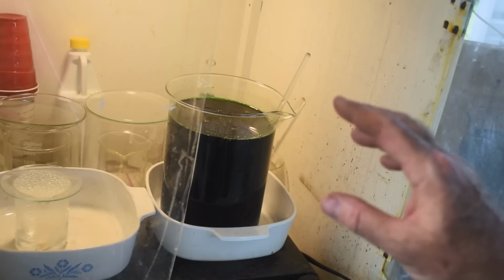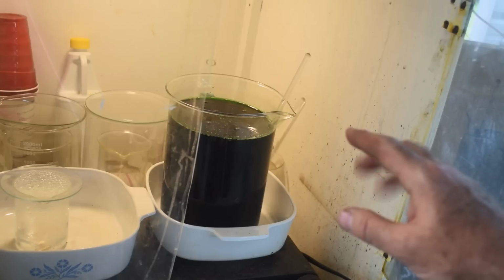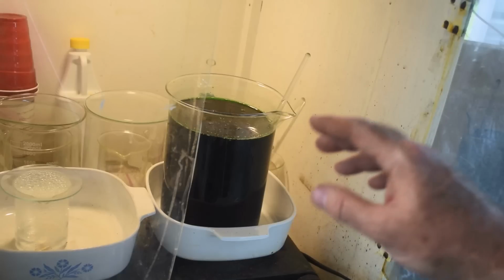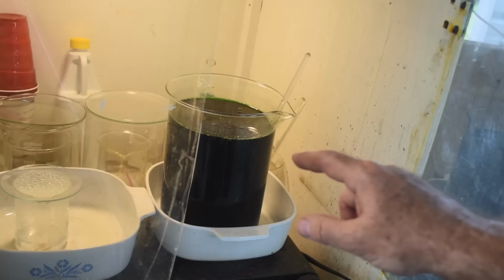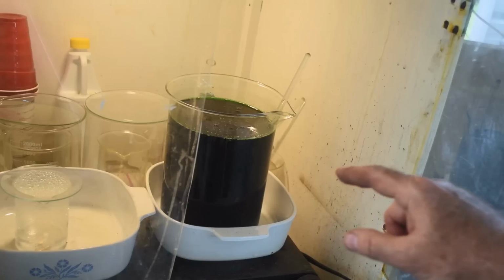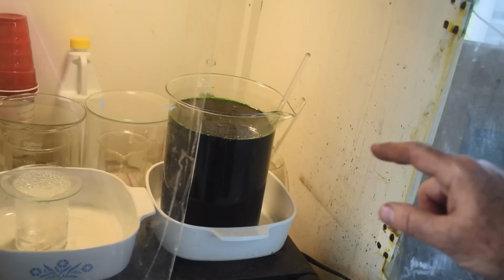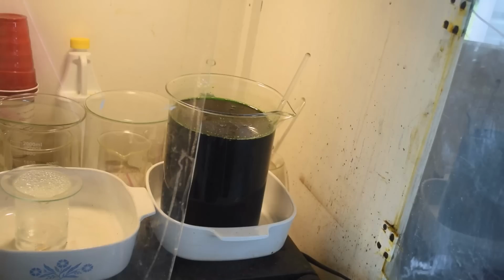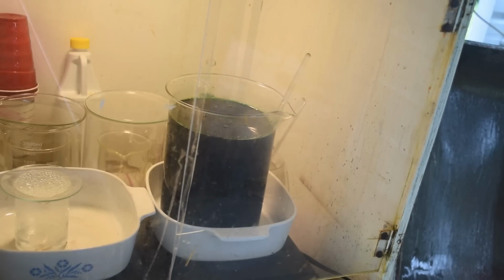I'm hoping that I can do that. So we're going to let this continue to hopefully soften up. I kind of doubt that's enough water to get it all in solution, but we'll see how it goes, and then move on from there. I'm just going to let this continue to cook for now, and we'll see how much of that solid we can get back in solution.